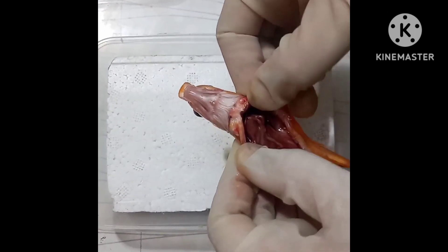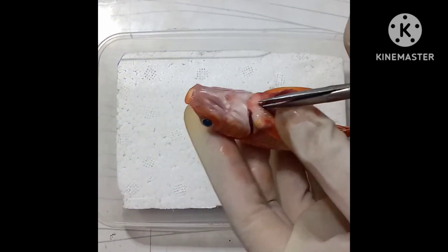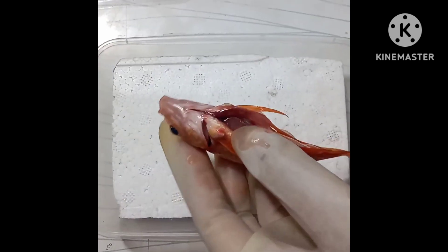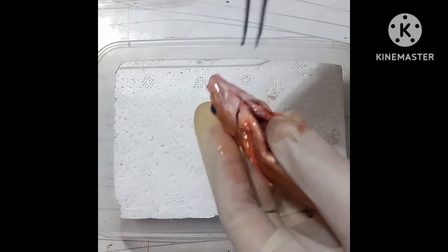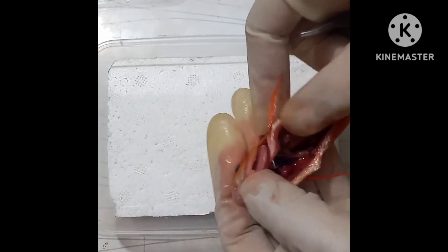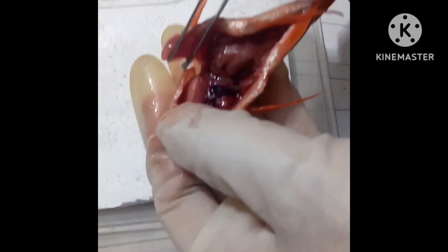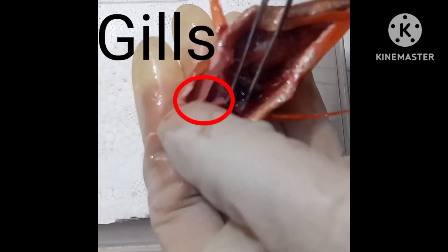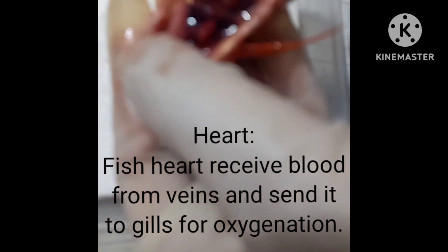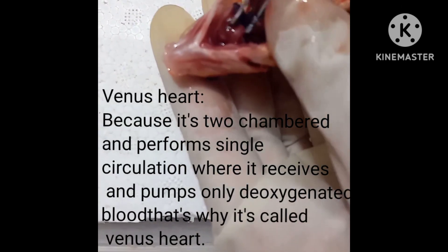As you can see, let's cut it a little further to see the gills and the heart also. As you can see here, these are the gills. This is its heart — a little tiny heart, a venous heart.